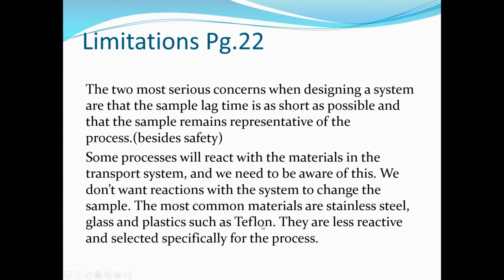You'll see Teflon membranes on a ton of the sensors that we deal with, and you'll see that mentioned in future lectures. Glass and plastics, stainless steel, they are less reactive and selected specifically for the process. And I believe the ILM has a table in it that tells you different types of processes and the different types of materials that are compatible with this type of processes.